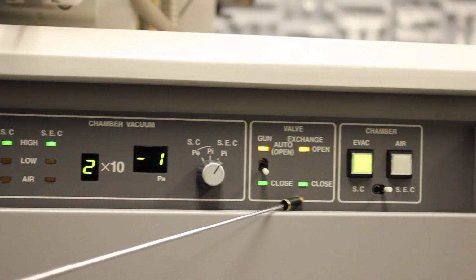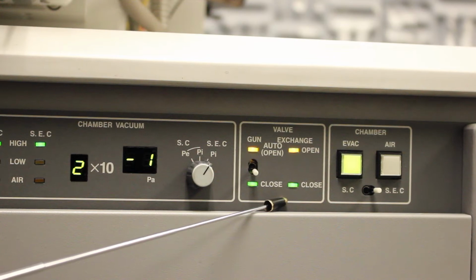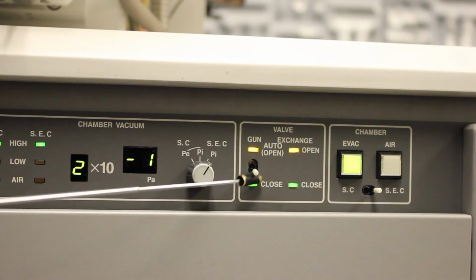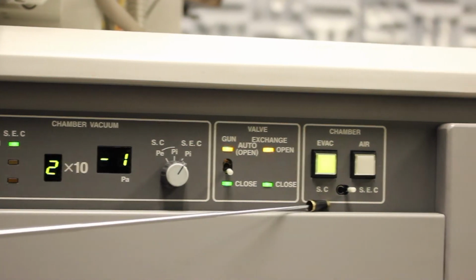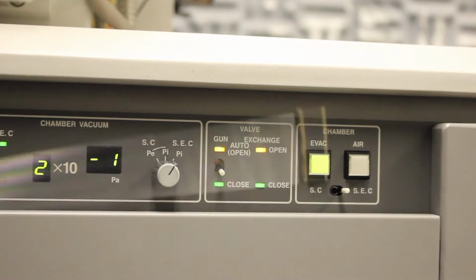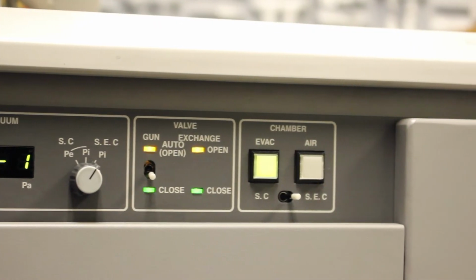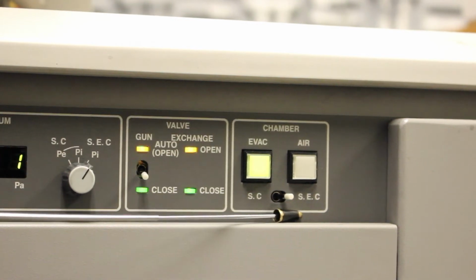This panel gives you the valve status. There are only 2 valves on this tool: the manual valve and the automatic gun valve. The correct colors here are both green, and these should be flashing. Last but not least, this panel allows you to vent the specimen exchange chamber or the specimen chamber. The typical default is that the specimen exchange chamber switch is in the right position.